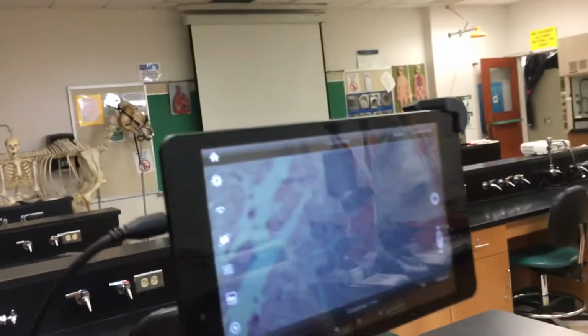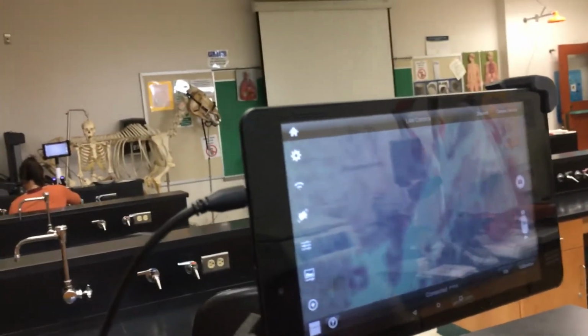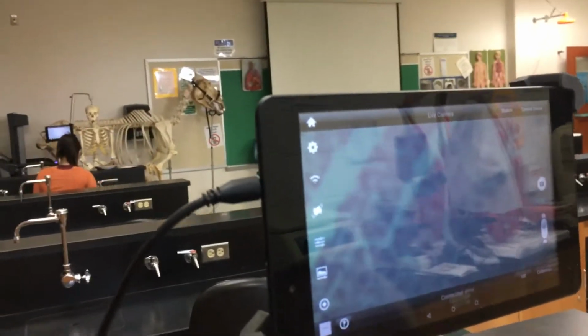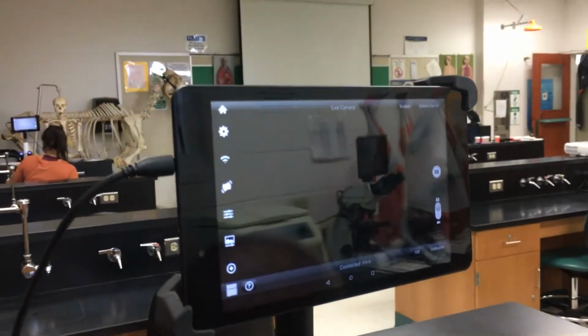It looks like... How does it look? Transverse, because I don't see a... I would agree. Not a basement membrane, like a connective tissue. Yeah, I would agree that it's transverse. Let's move on to one of the other ones first and come back to this guy. Okay.